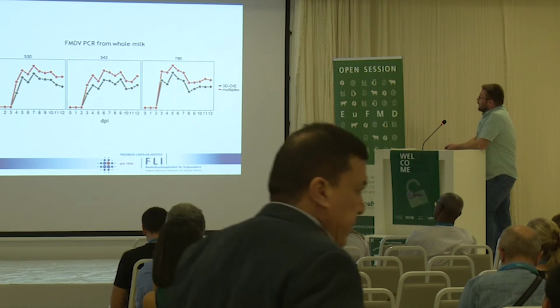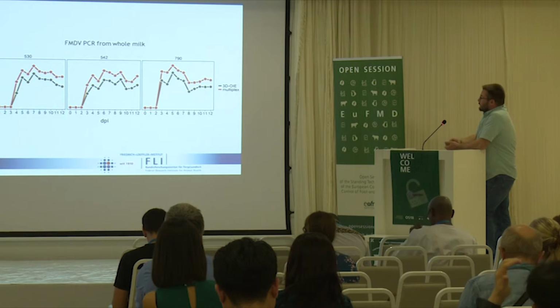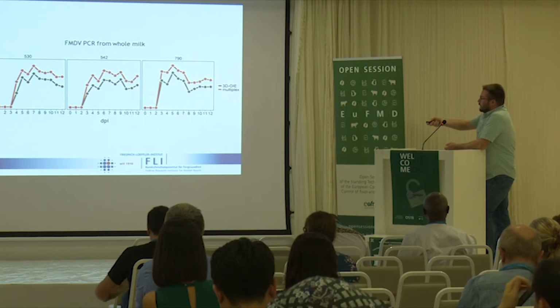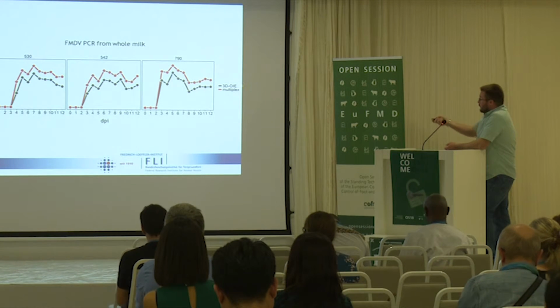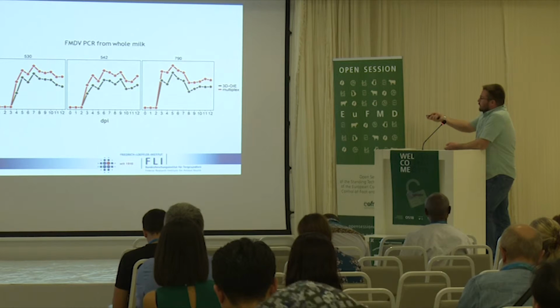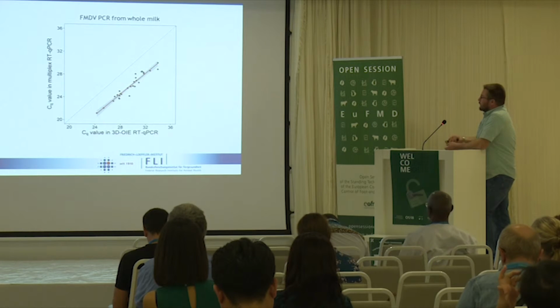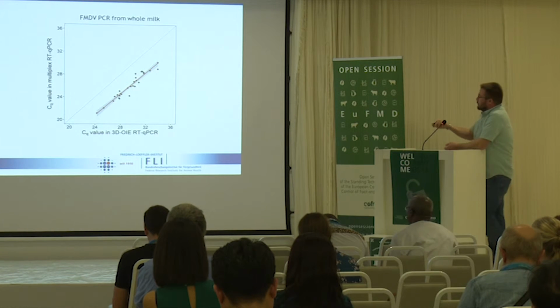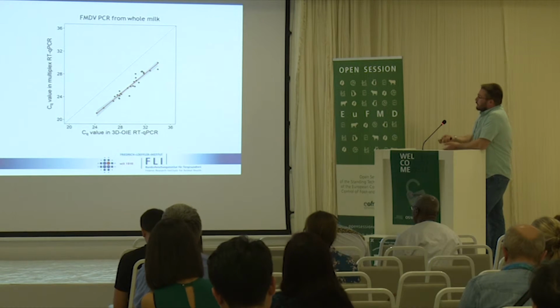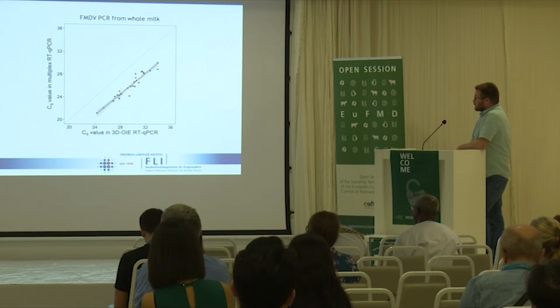We here have the regular 3D PCR in black and the multiplex assay with the same samples from these 3 animals that we infected, and you can see that this is very much paralleled, the detection in the multiplex compared to the 3D, and in general, the CQ values in the multiplex were lower than the CQ values in the 3D. And if you do the same thing, just on a scatter plot, you see it again. So they are very highly correlated with generally lower CQ values in the multiplex, so below the diagonal.